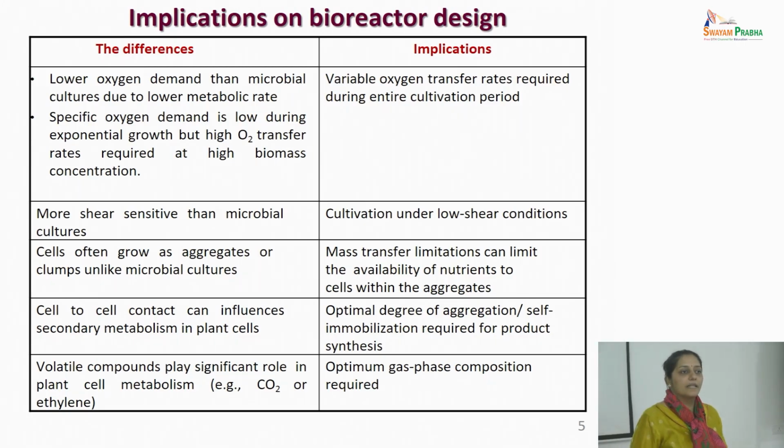We had ourselves done that experiment in Viola odorata cell suspension cultures, and we came up with a power law model where we could easily see, in the log phase, that as the cell density was increasing, the Newtonian behavior was lost. Whatever models and assumptions you make, you assume these are homogeneous suspensions, so there's no heterogeneity and the viscosity is always the same. Based on these assumptions, all these microbial fermenters and fermentations have been designed. Now plant cells will deviate.